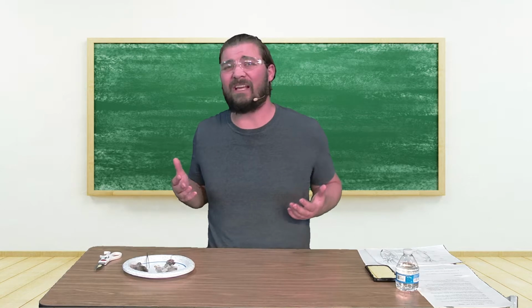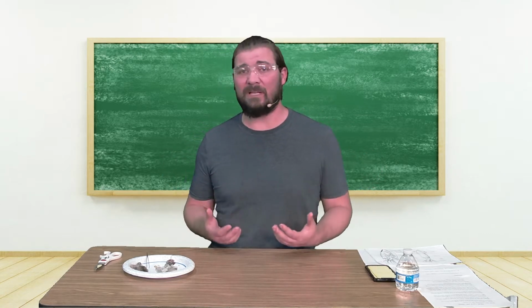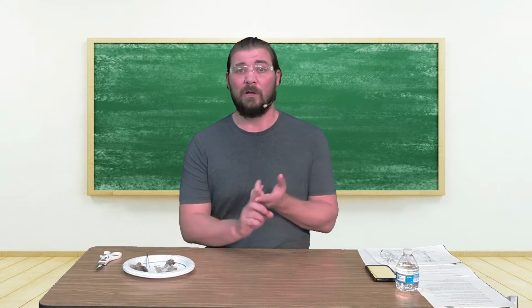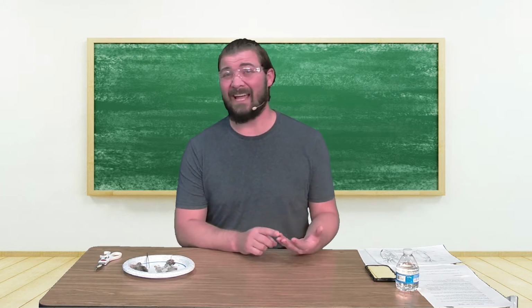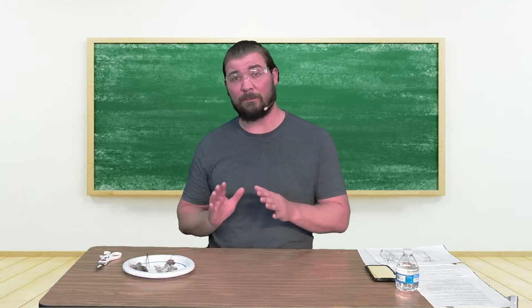squid. Now, if you think about what is important for keeping something alive and to continue the species, it's got to be able to find food, it's got to be able to survive predators, and it's got to reproduce. So here our squid has an ink sac to avoid predators.